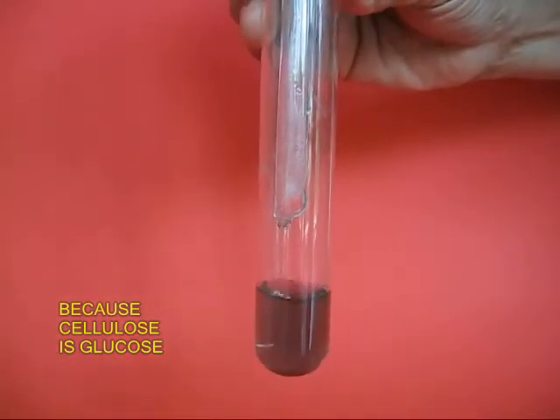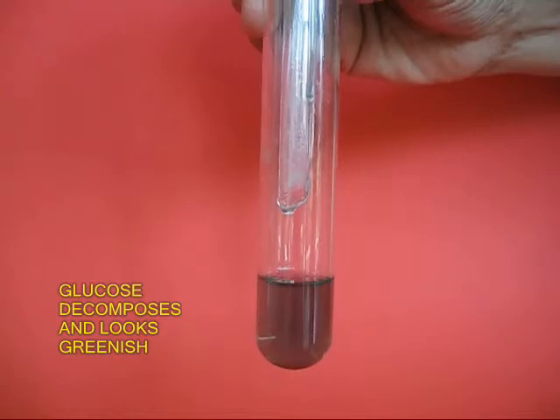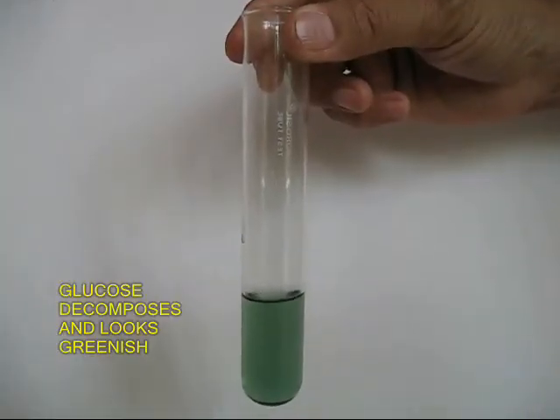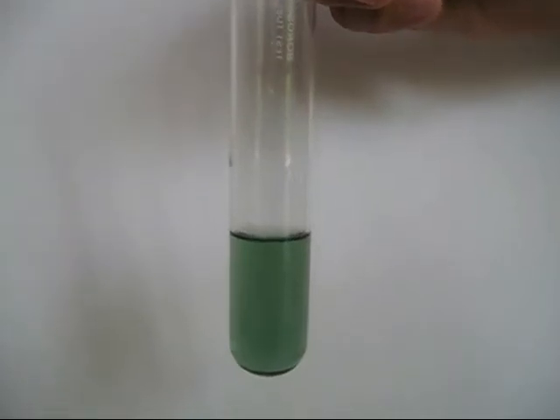This is because the filter paper is made from cellulose, and the cellulose decomposes, and that is why the solution looks greenish. It is an interesting color filter, as you can see.